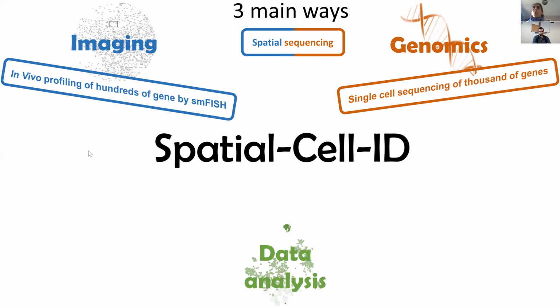Okay, so how are we going to do that? So what we did basically is to look a bit in the literature, how people are doing spatial transcriptomics. There are actually many different ways you can do that, some of which rely on equipment and some of which rely on quite expensive and complicated consumables. So we decided to focus on the ones that require equipment because this is an EquiPEX. And so we identified 3 main ways which seem to be the most simple and easily applicable to different types of samples.